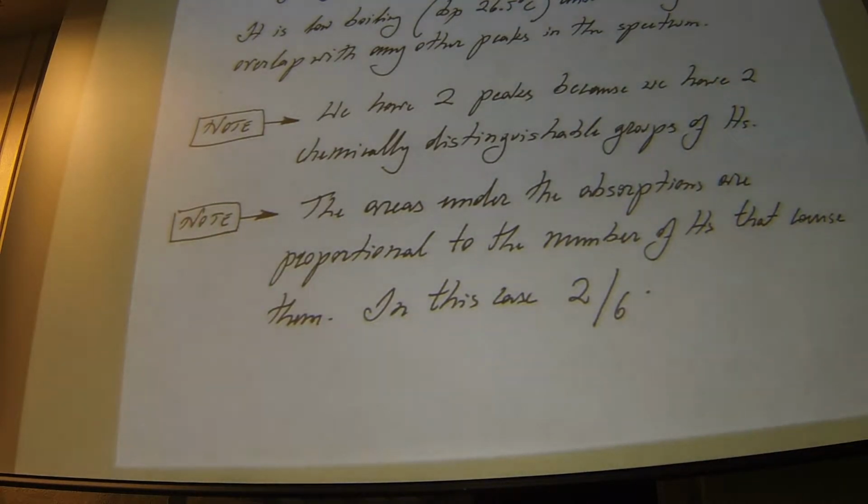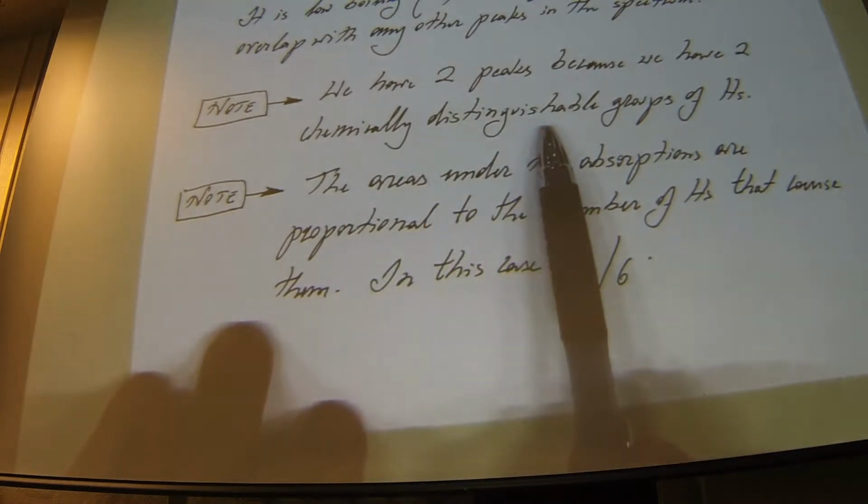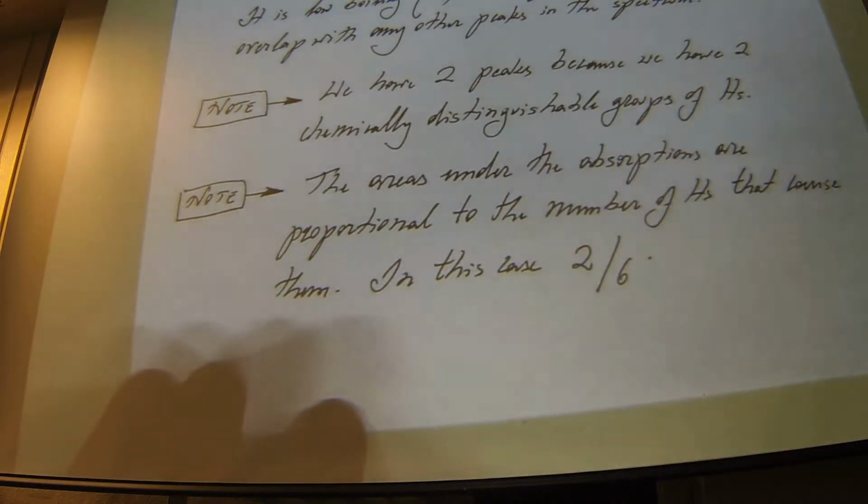Because you could have chemically distinct protons, but the difference in their absorption is tiny, and so even though they are different, you can't really tell because they're right on top of each other or almost on top of each other. That can happen. However, whenever you have chemically non-equivalent protons, you will have distinct peaks in the NMR, except if they overlap accidentally, which can happen.